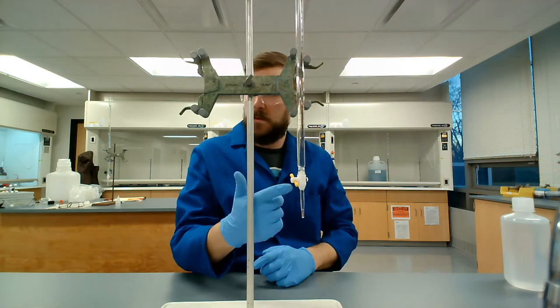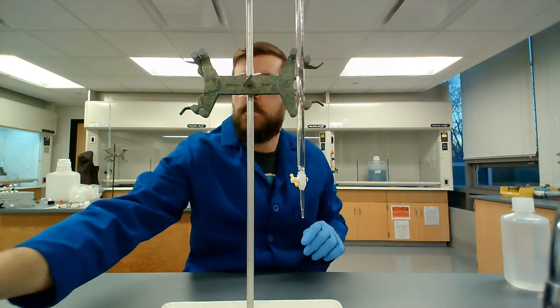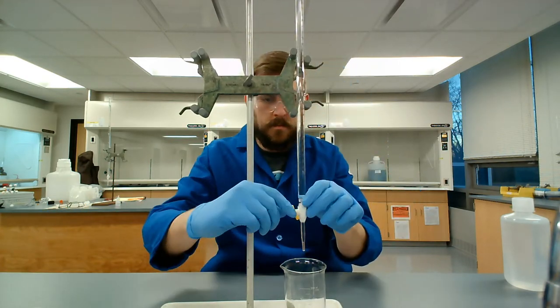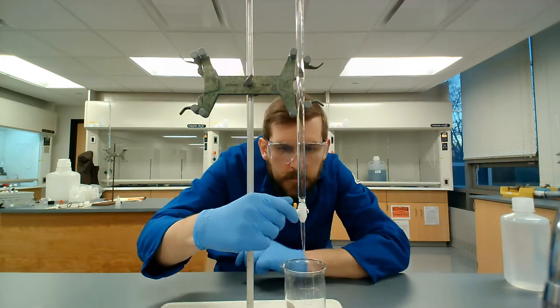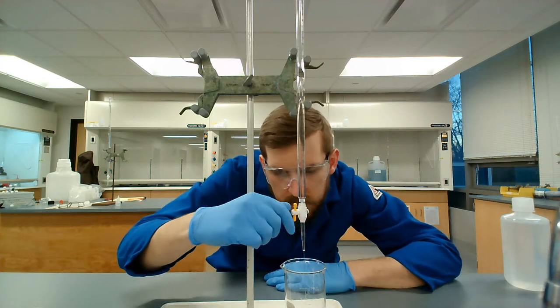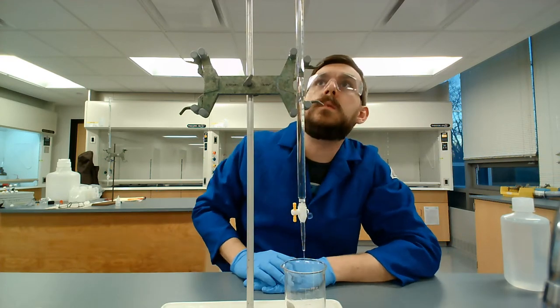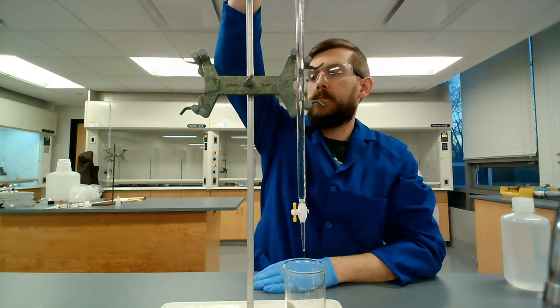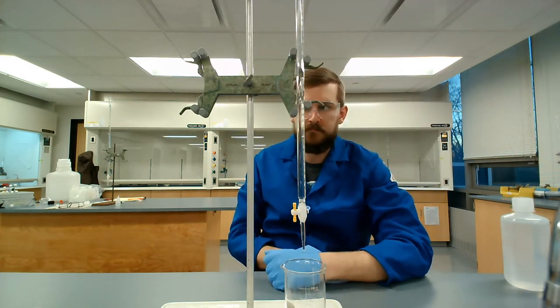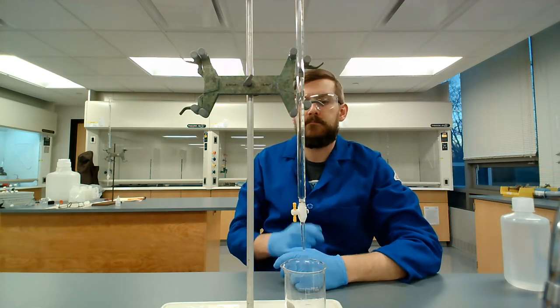I store them this way to keep particles and dirt out of them so they stay clean. And before you ever use a buret, you should drain some liquid through it to make sure that it is draining properly. So I've opened the stopcock here at the bottom, and I'm inspecting it to make sure that I have a steady stream coming out of the buret. I'm also looking up to make sure that the meniscus is draining properly, a uniform drop, rather than getting caught up on particles on the inside.